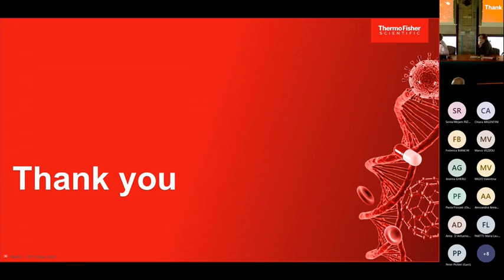So actually, I have a science question. You have such a broad overview of lots of people who work with the Orbitrap and have the latest innovations. My question is related to the way we classify cell types today, which is basically based on how they behave and how they look under the microscope, right? With the technology we have today, that seems like medieval, right? I'm wondering if any of the people that you work with have thought about proteomics becoming a better classifier, where we will rename cells based on the type of data that we are generating with single cells today?